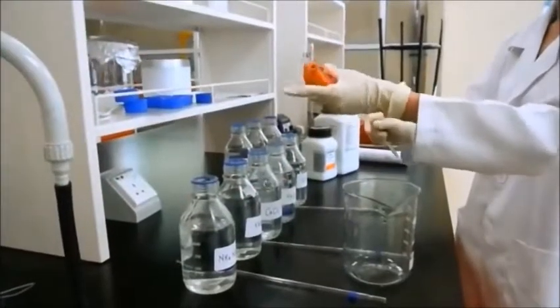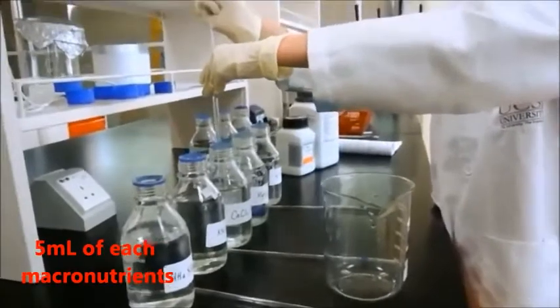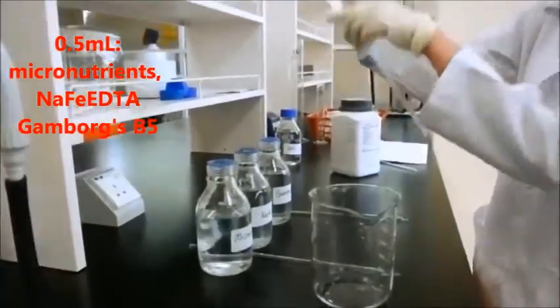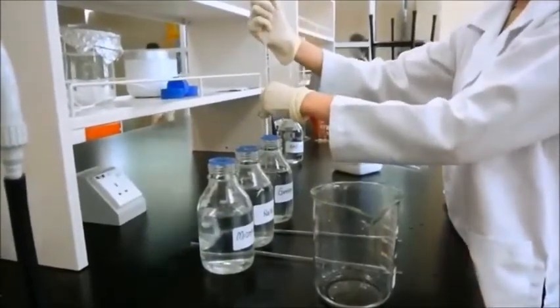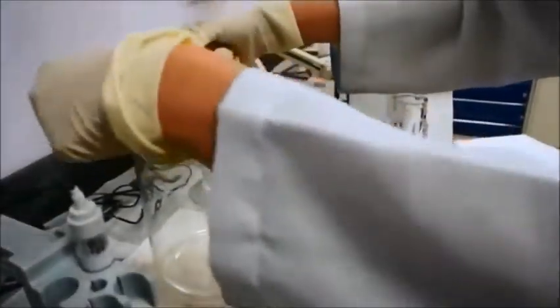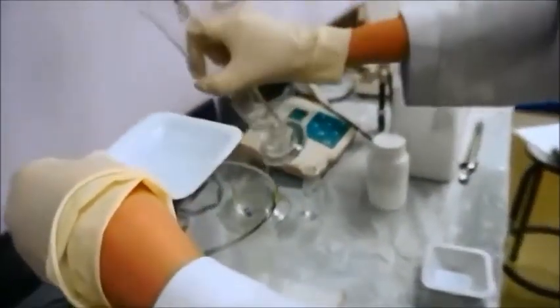For the half MS medium preparation, 5 ml of MS macronutrients, 0.5 ml of micronutrients, 0.5 ml of sodium iron EDTA, and 0.5 ml of B5 vitamins were added into a 500 ml plastic beaker. Then 2 g of sucrose, which constitutes 2%, was added. The solution was dissolved completely with 50 ml of distilled water in a beaker using a magnetic stirrer.